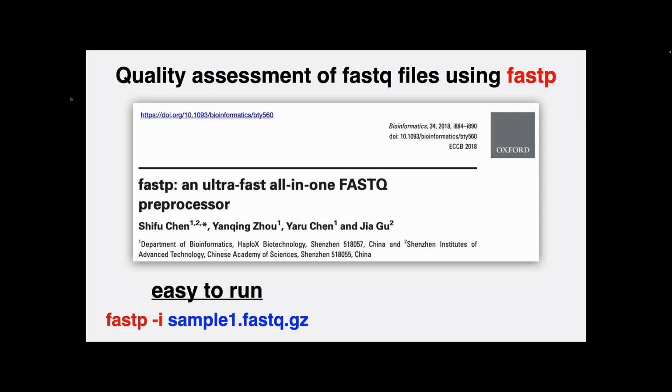Now, for those of you that installed fastp instead of or in addition to FastQC, it's also really easy to run. Again, you just call the program by name and you point it to a FASTQ file.